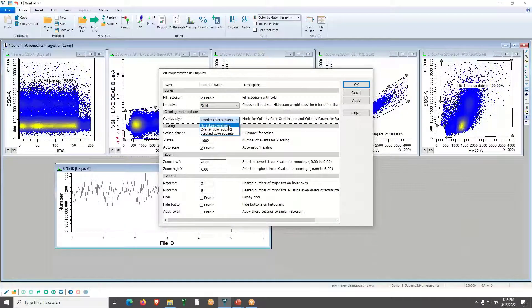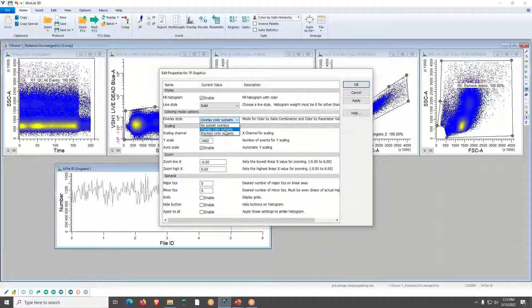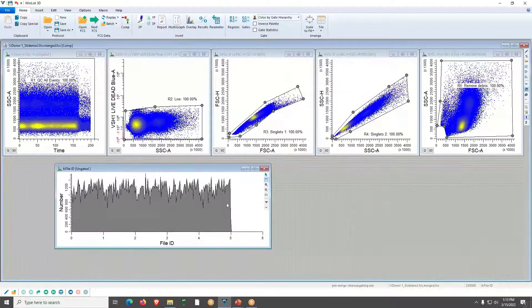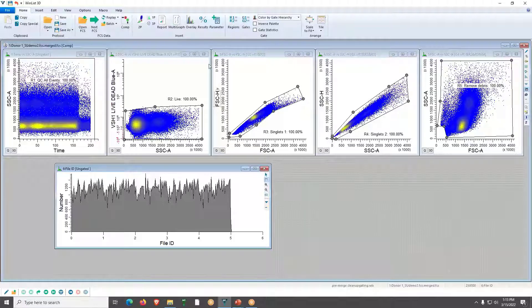I'll change this to no subset overlay — you have a couple of options for coloring histograms: overlay color subsets, stack them, or no subset overlays. For now we'll do no subset overlays and click OK. That fills it with an ungated coloring. The next thing is something unique to WinList called a Region Array.